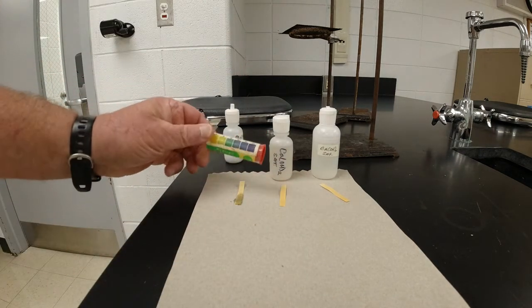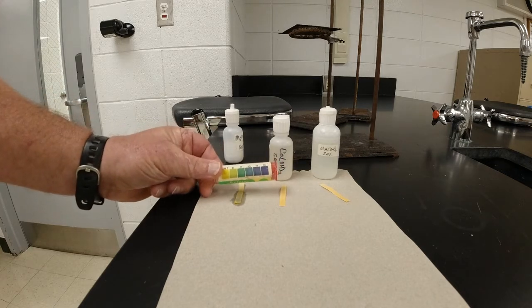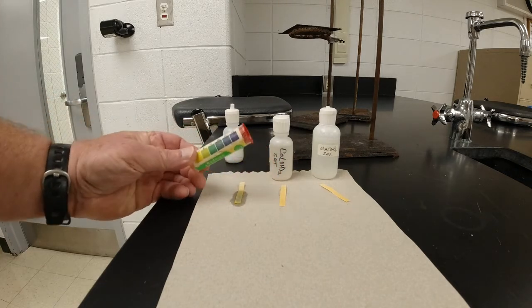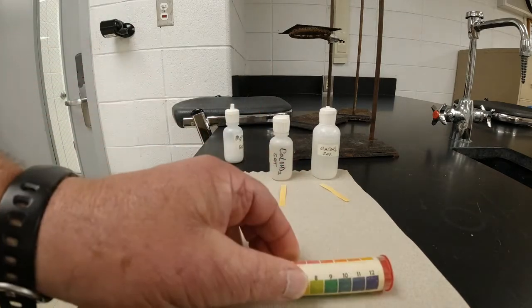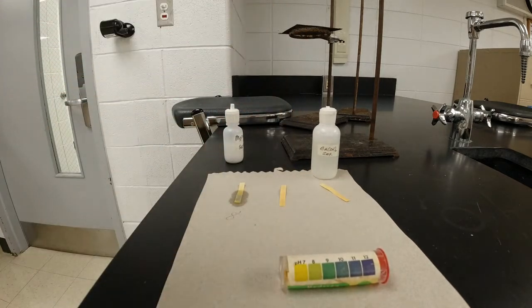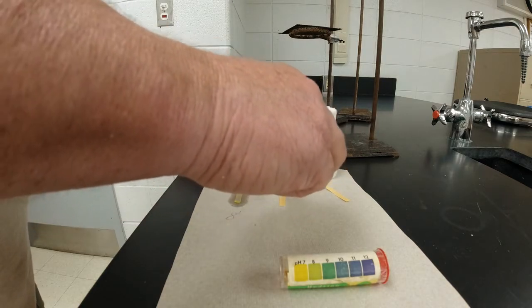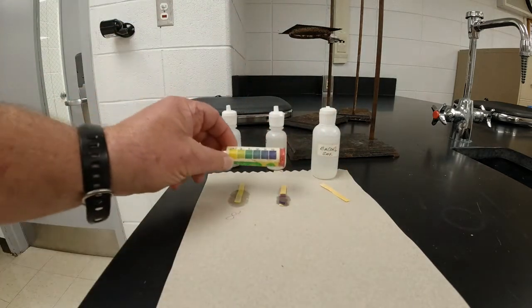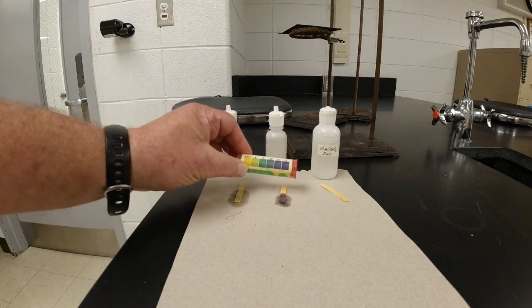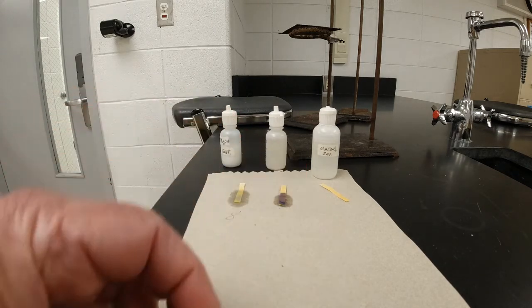and immediately it's kind of a yellowish green color, probably about an 8. All right, so we're going to write that down so we remember that. That one's about 8 for the pH. Let's add calcium hydroxide. So we add a drop of calcium hydroxide to it. Whoa, and that one's much darker. That one's more like, oh, probably about a 12. All right, so we're going to put 12 down for that one.